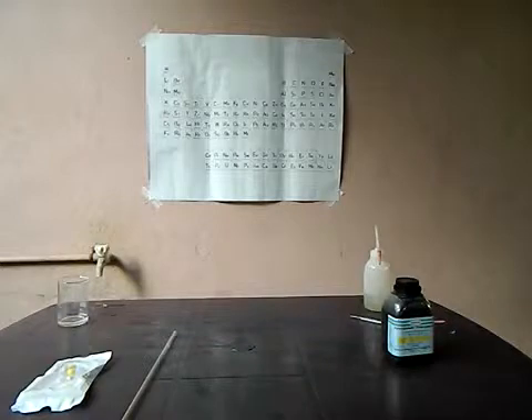You just have to spend around 200 rupees — that means about 2 American dollars — whereas a regular burette actually costs more than 500 rupees, which would be more than 7 or 8 dollars.